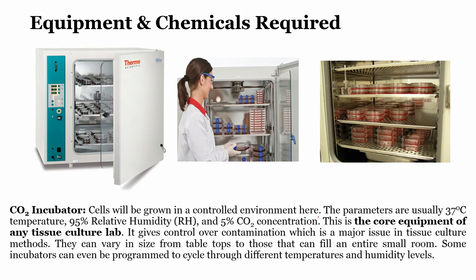and like I discussed, the parameters usually are 37 degrees centigrade temperature, 95% humidity, 5% CO2, and this is the core equipment of any tissue culture laboratory. It gives control over contamination, which is a major issue in tissue culture labs, and the size can vary from tabletop to those that can fill an entire small room. Some of the incubators can be programmed to cycle different temperature and humidity levels. If you see here, we can program different temperature and different humidity levels depending on the application of the work.